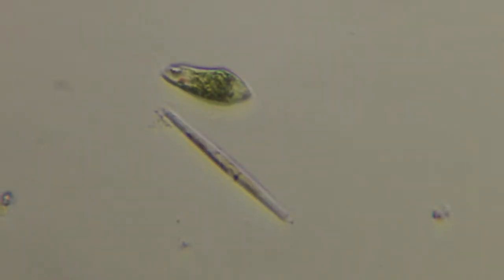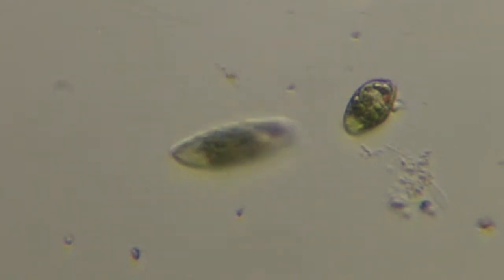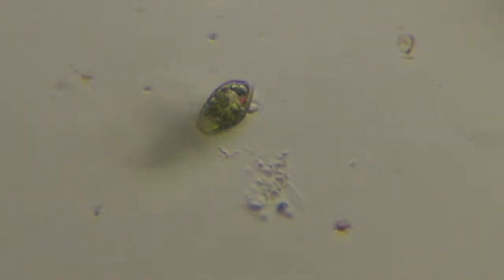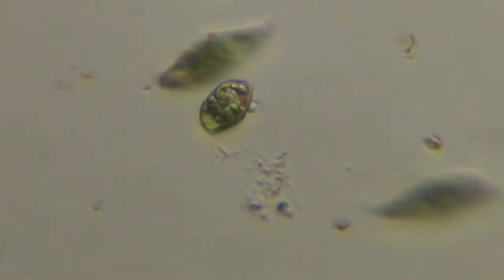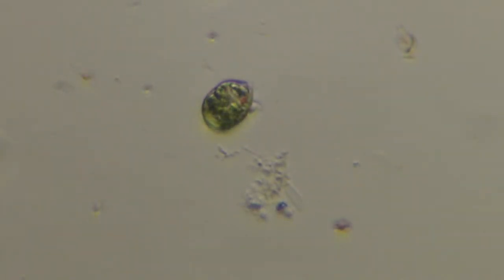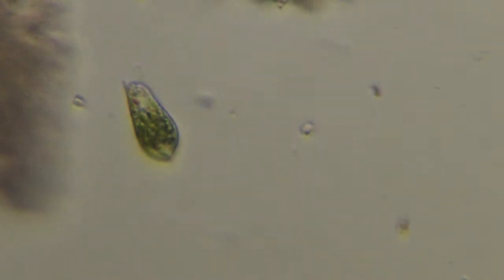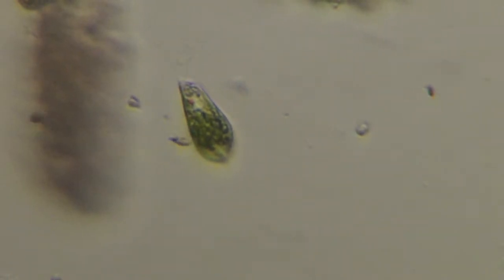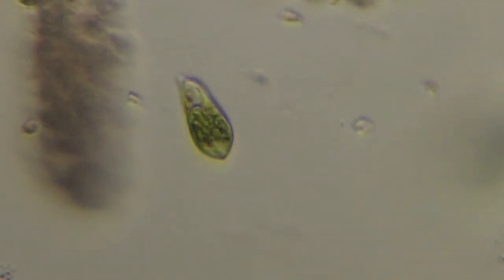Yeah. So there's a Euglena just chilling. There's an active one cruising by, a little bit bigger. There's one that's also just hanging out, but you can clearly see that eye spot if I didn't focus it correctly there. Kind of orangey red eye spot. And here are a few just hanging out by this cluster of junk. Again, long flagellum whipping around, you can see that.